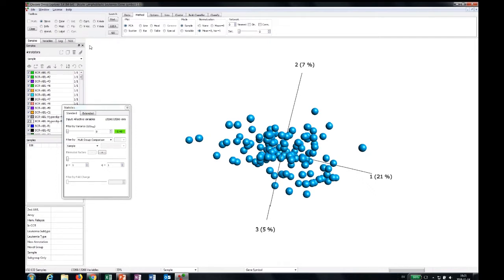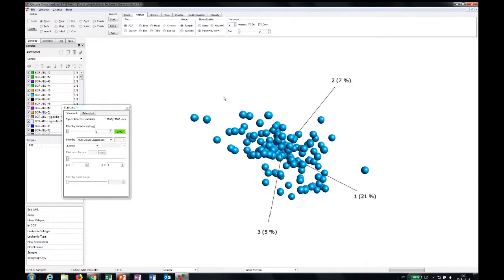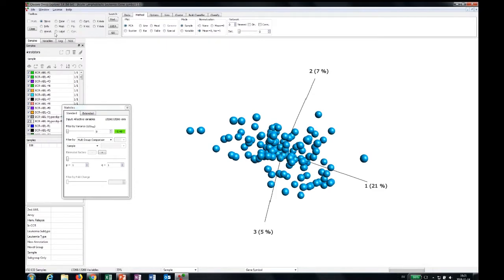Up to the left here, you have the toolbox where you control the pointer. So now it's in move mode. If I select label mode, I can label a sample, and I can clear it. I can also label by pressing in tables like this. There are many more options here, and I will use some of them as we do the demonstration here.